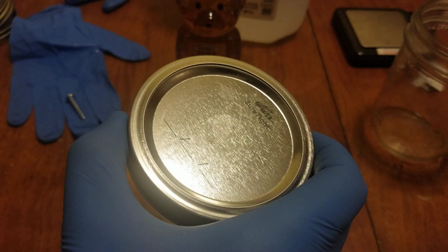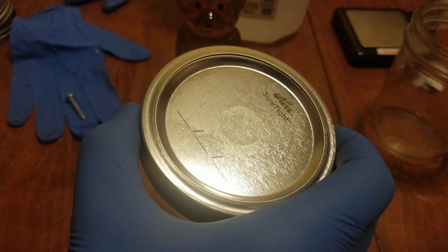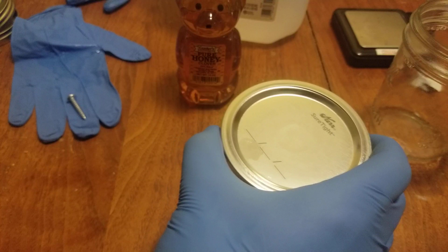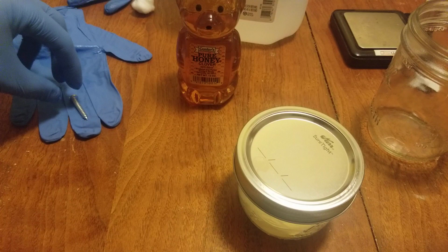I checked the math too. I was correct. So 4% of 150 is 6, and so that was correct math. So 6 grams of whatever you are using in that is completely dried now. So I was right on that. You can take my word for it.